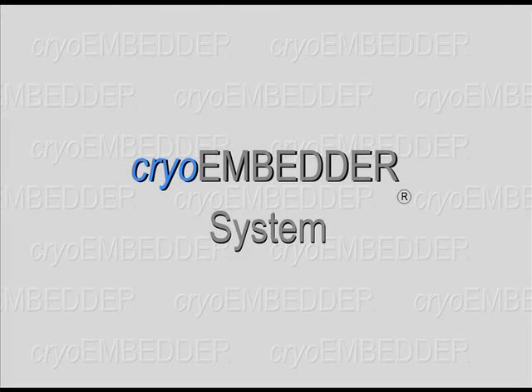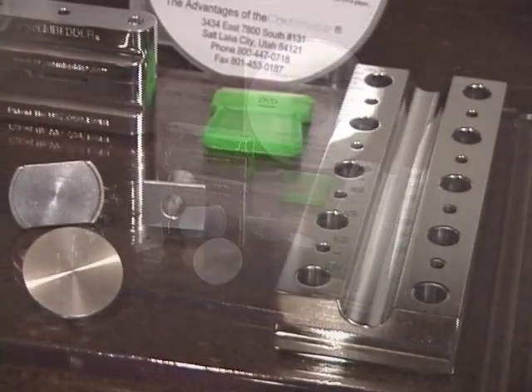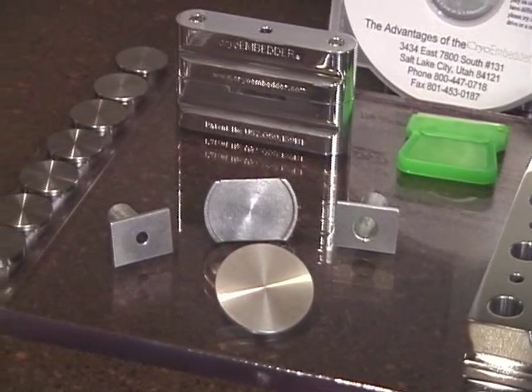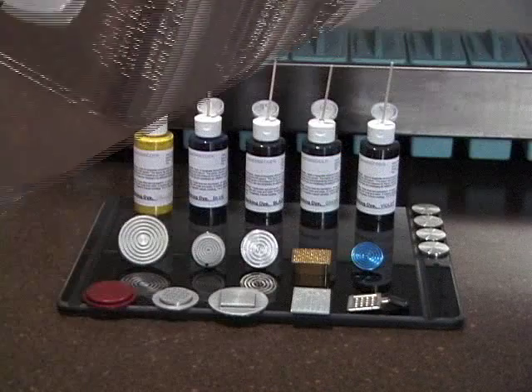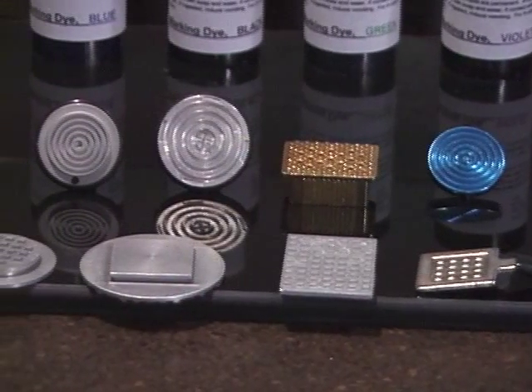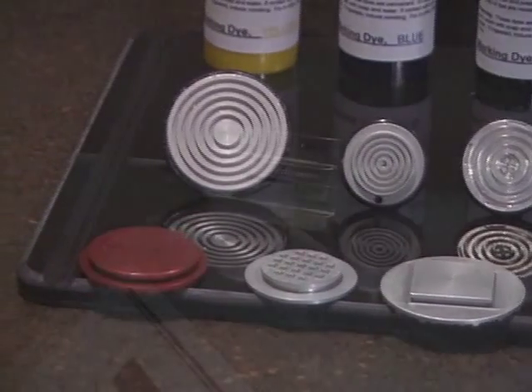The cryoembedder system — a tested and proven method for preparing tissue for frozen sectioning. It consists of a cutting board, chuck holder, cryostat adapters, a trimming blade, flat embedding discs, an instructional CD, and the embedding device. It works with the cutting chucks from all makes of cryostats: the IEC, the old Shandon-Lipshaw, the Tissue Tech, the Microm, the Leica, and the new Thermal-Shandon.